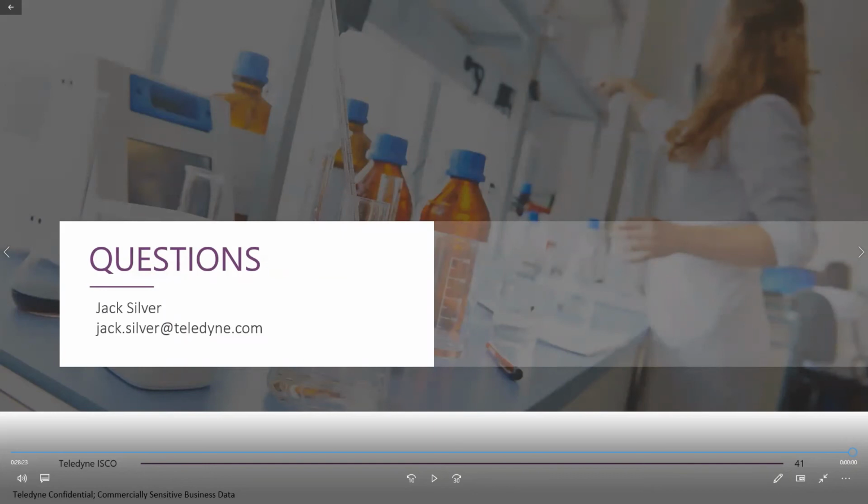For a C18AQ type column, you would enter, say, 0% B, since that can run in water. For regular C18 columns, I usually enter about 5% B as a starting point. And then when you run the column on the AccuPrep, when you choose the column, you can then choose the method, and the scouting run will be among those methods.